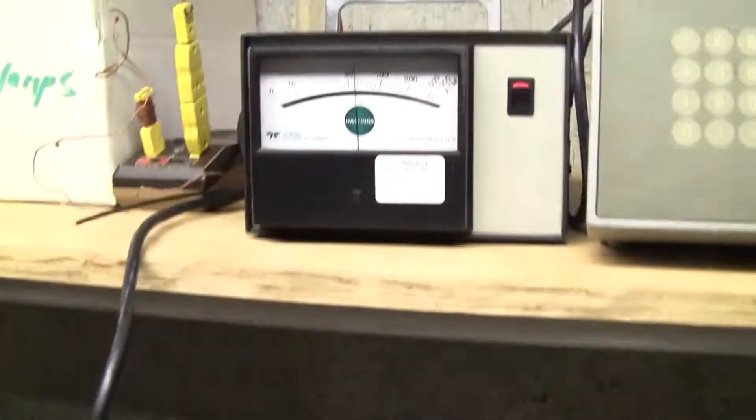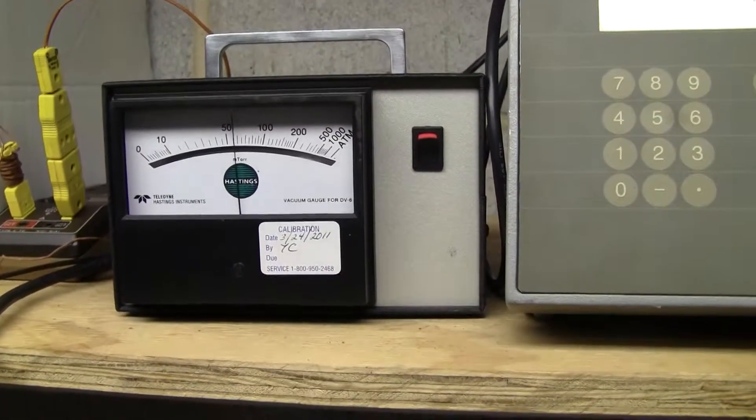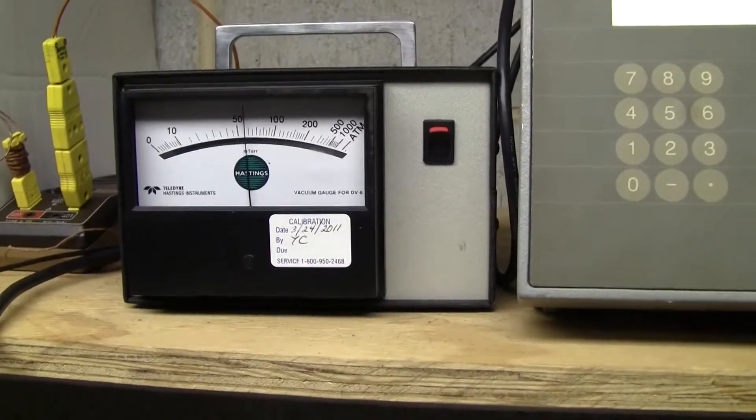The pump looks a little beat up. However, it's pulling right around 60 millitorr.